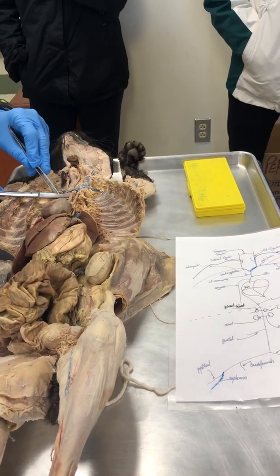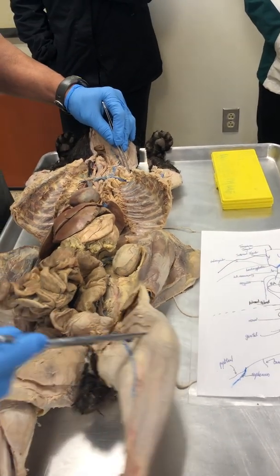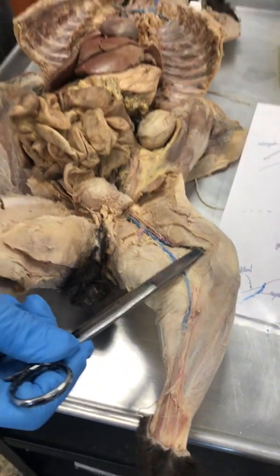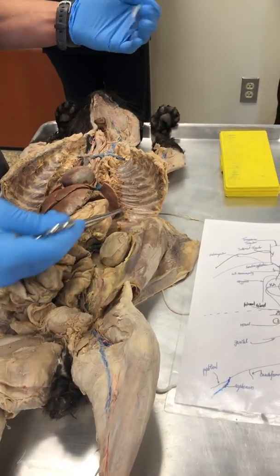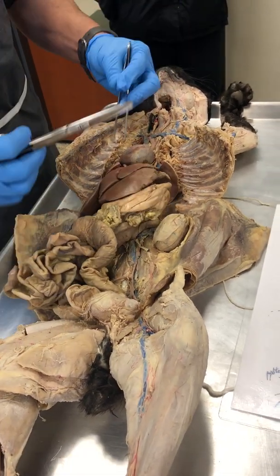So you can see the pink paint in the arteries. And as blood is drained, they will inject blue paint into the veins. So blue for veins, red for arteries. All right? So that helps us nicely, because when we look at all of these, we can actually see the veins and the arteries. All right? So there's the heart right there, folks.